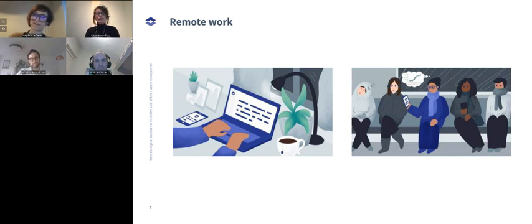So do we already have the technology to empower remote work, or what are the remaining challenges, and the opportunity also for a digital lab assistant? Andrew, do you want to start? Yeah, sure. I think you quite rightly pointed out that we already have some of these tools in place to do remote monitoring of experiments and what's going on in the laboratories. I can remember people doing it with webcams 14, 15 years ago, back when the internet was something you dialed up into.